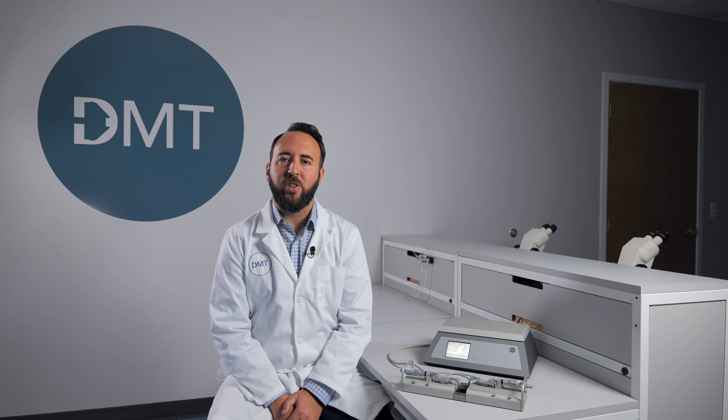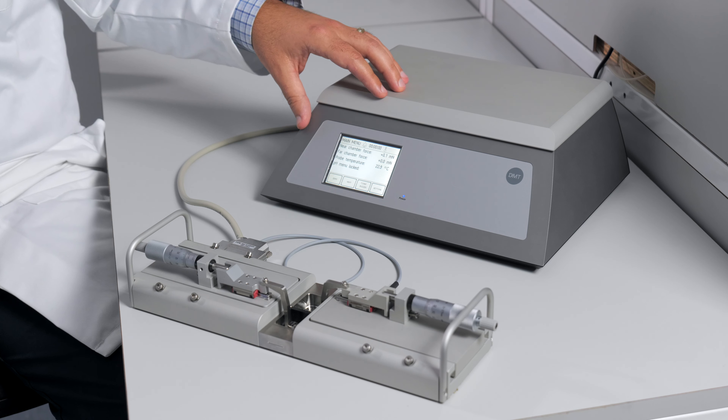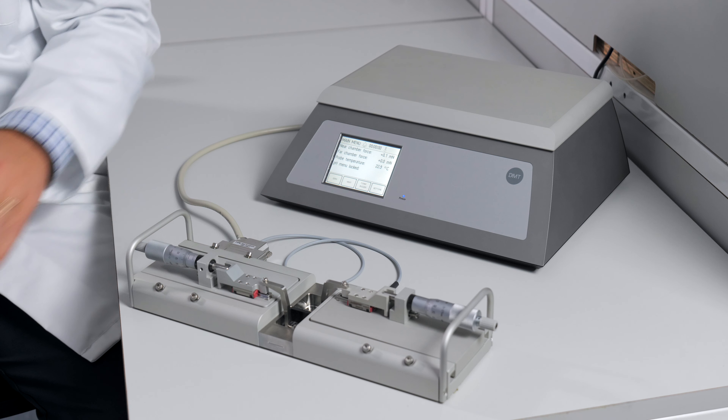This video will serve as an introduction to the 420A dual chamber wire myograph system. We're going to look at the interface, the chamber, and the accessories that come with the system. This was one of the earliest myographs released by DMT in the early 1980s and it has been updated and reintroduced. The small footprint and efficiency make for an excellent side-by-side study device.